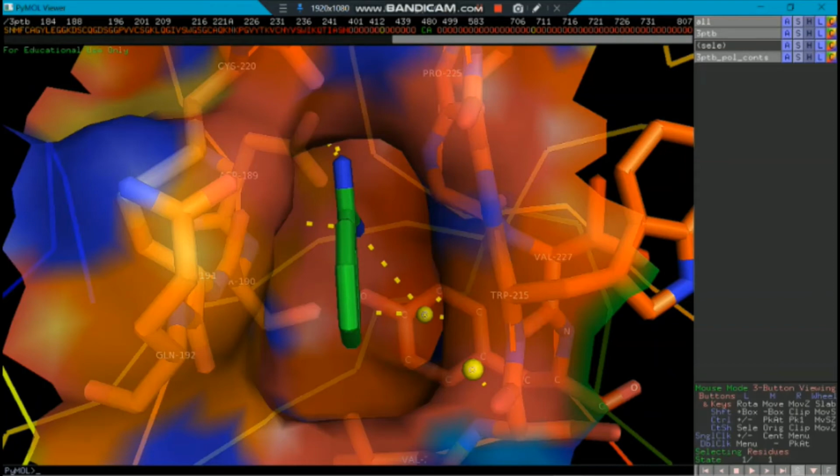So what this water molecule actually does is, we have two water molecules here, and the water molecule which is fitted inside the binding pocket facilitates the interaction between the amino acid which is present behind the binding pocket and the ligand.